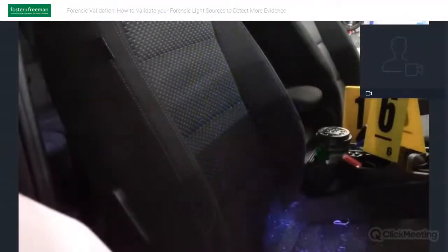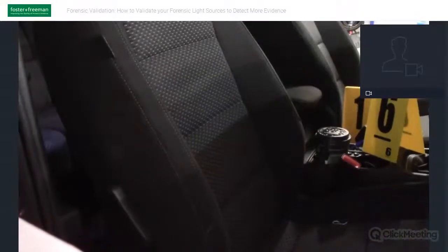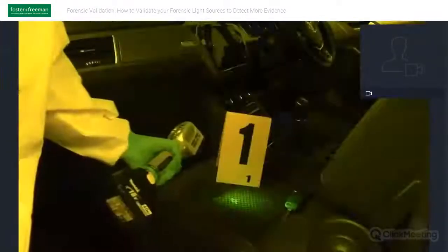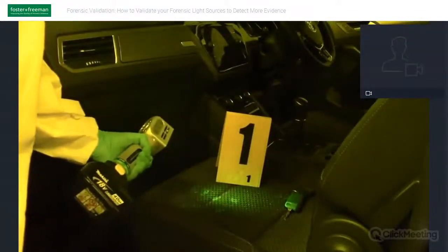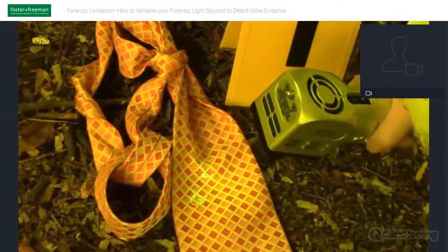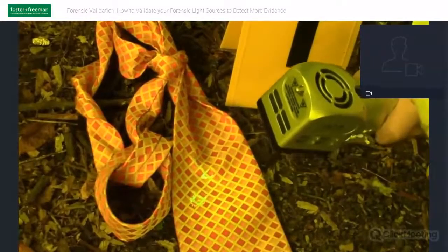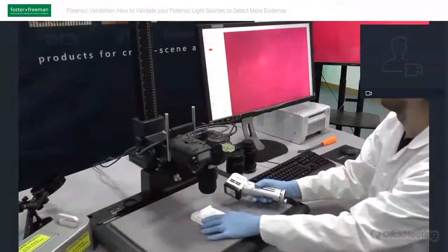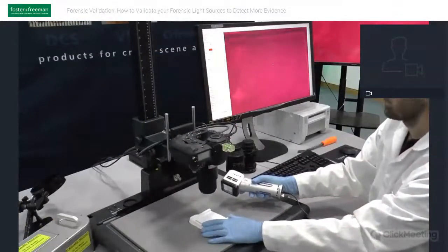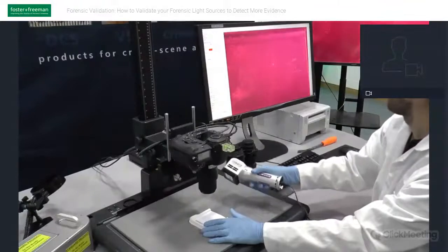If you have a UV sensitive camera fitted with a UV pass filter, it is possible to see the UV radiation that is reflected back by the evidence or background. The different quantities of UV that are reflected and or absorbed create and improve contrast between surfaces and the evidence types upon them that cannot be seen by the naked eye.